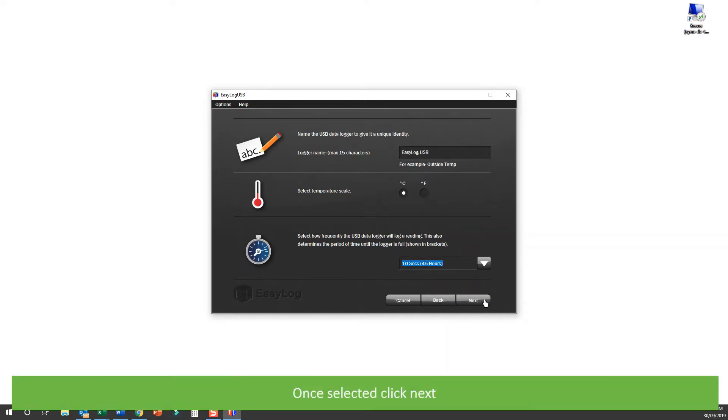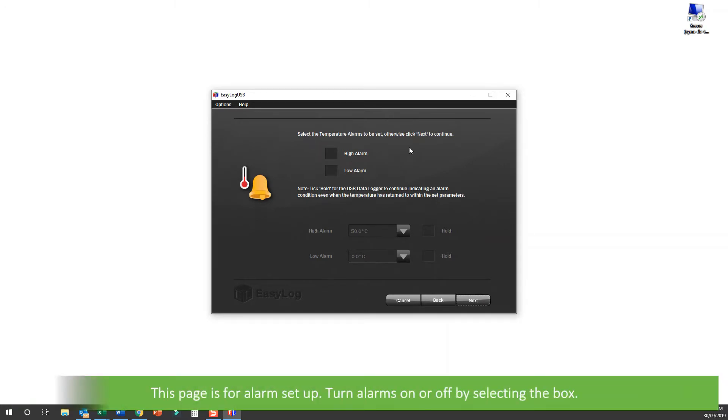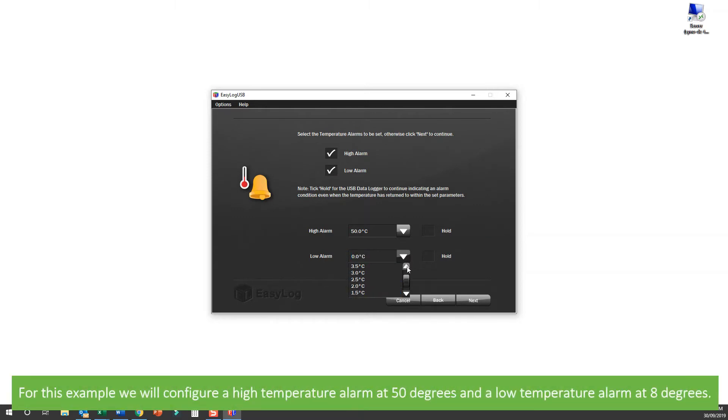Once selected, click Next. This page is for alarm setup. Turn alarms on or off by selecting the box. If you choose to turn on a high or low temperature alarm, the software will then allow you to select alarm temperatures. For this example, we will configure a high temperature alarm at 50 degrees and a low alarm at 8 degrees.